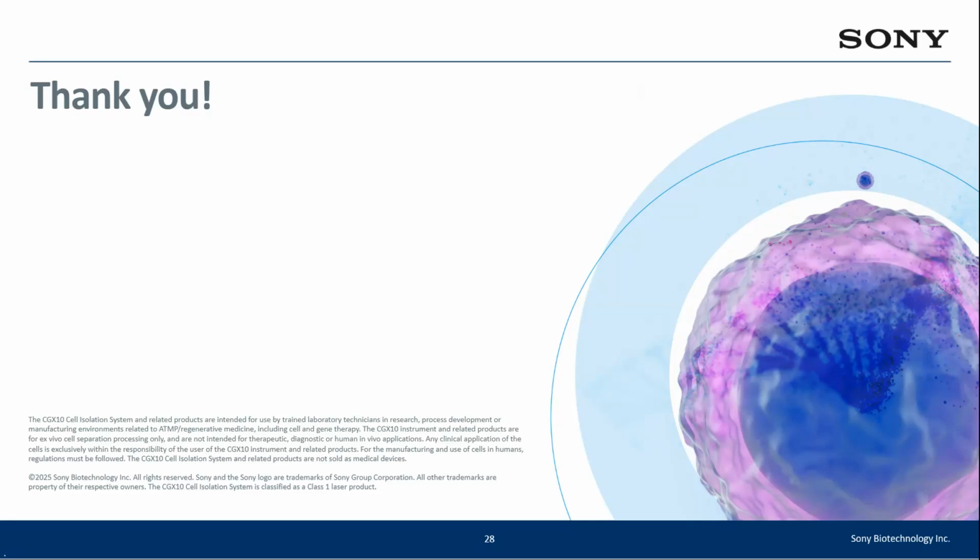Our next question here asks, what makes CGX10 consumables GMP ready? Are they irradiated? Maybe I can take that. Thanks, Casey. And that's a very insightful question. So, actually, the CGX10 consumables like the tubing kits used for process development or GMP operation are not irradiated. But in fact, they are sterilized using ethylene oxide gas according to ISO guidelines, which are relevant for typical GMP grade setting.